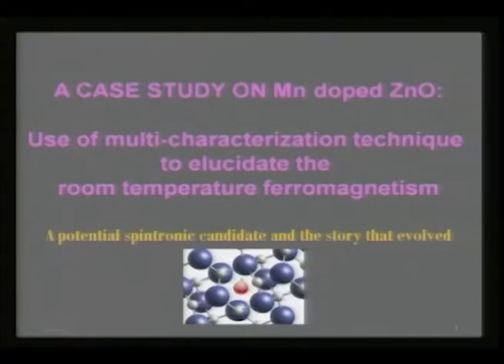Yeah, in this module we have been looking at the characterization techniques, and how we can learn from these instruments, namely diffraction, spectroscopy, and microscopy methods. Instead of learning each and every technique, it is better that we look at some case studies, and then we will understand in a comprehensive way how we can use these techniques to elucidate structure and to correlate that with the property that we are seeing.